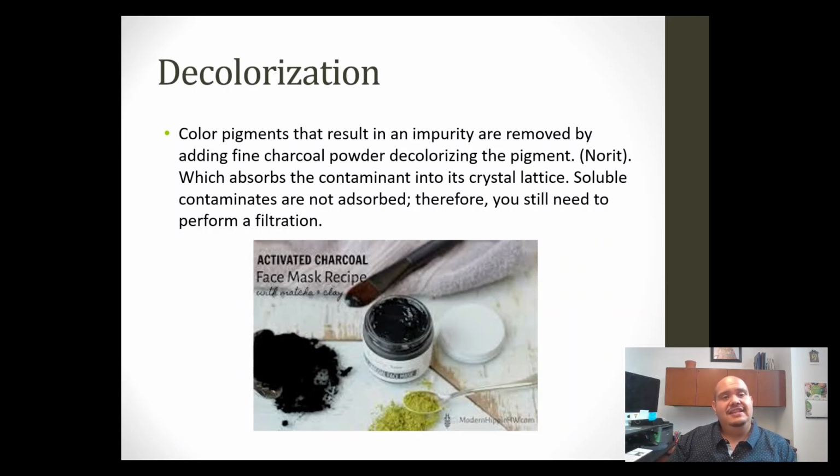So by that means, decolorization is the usage of charcoal in order to remove impurities. But remember, you've got to remove the charcoal before you can start to recrystallize. Otherwise, you have to boil it all down because your solute will crystallize in the charcoal. You want to make sure that it's hot and that the crystal is completely solubilized in the solvent. So when you're putting it through the gravity filter, the only thing that's staying on top is the charcoal and the impurities that it's sucked out. And what's coming out on the bottom is your pure, hot solvent with your hot solubilized crystal.